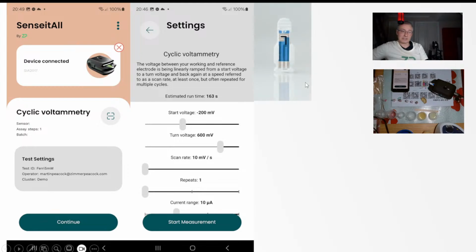So I did do that test, and in fact I did it on one of these hypervalue carbon electrodes. I absolutely love the fact that, and it wasn't by design, we started putting them into this cartridge format, and it just makes such a difference, both from the teaching perspective, but also in the imagination of how can we turn electrochemistry into a product?